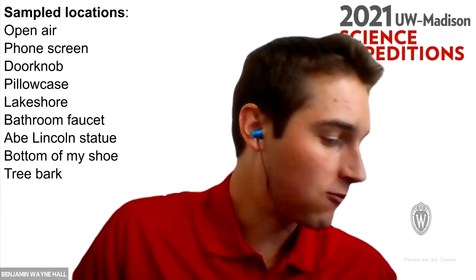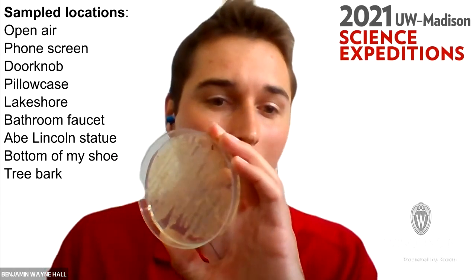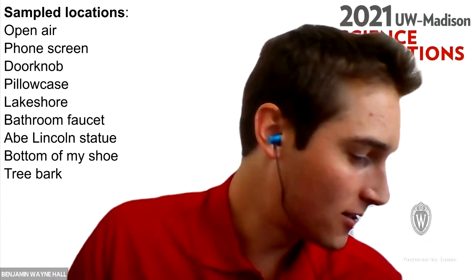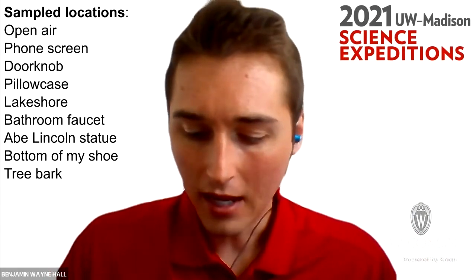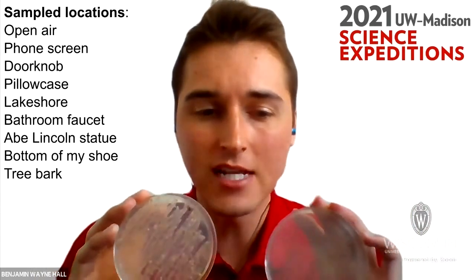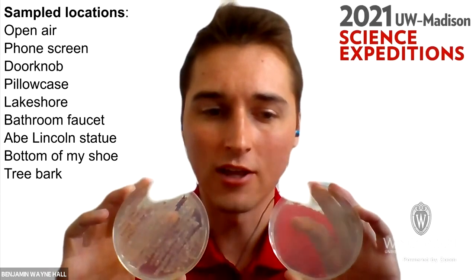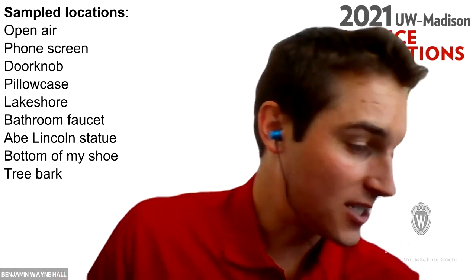So from this experiment, we can say it appears to us that bacteria really like the muddy lake. And maybe they don't like my phone screen too much, which again, this is from the phone screen. So if I can ask for a follow-up, think about what's different about the muddy lakeshore versus the phone screen that bacteria might like more than another. And as you think about that question, I'm also going to talk about bacteria.